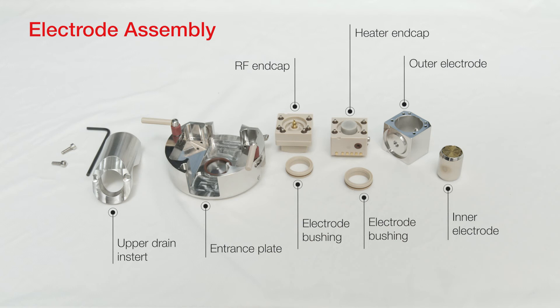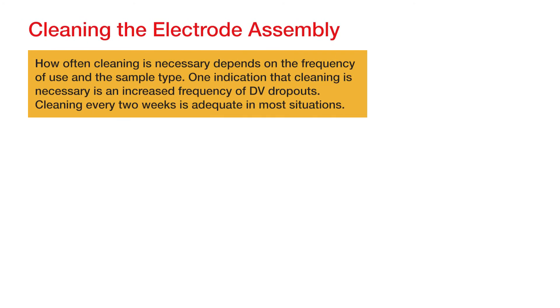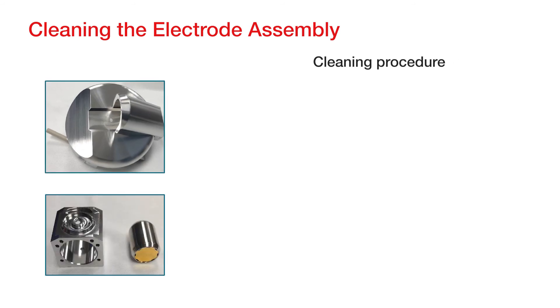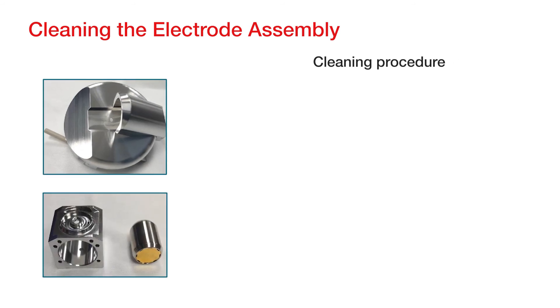Once the electrode assembly has been disassembled, it can be cleaned. How often cleaning is necessary depends on the frequency of use and the sample type. One indication that cleaning is necessary is an increased frequency of DV dropouts. Cleaning every two weeks is adequate in most situations. Only Optima LC-MS grade materials should be used for cleaning.